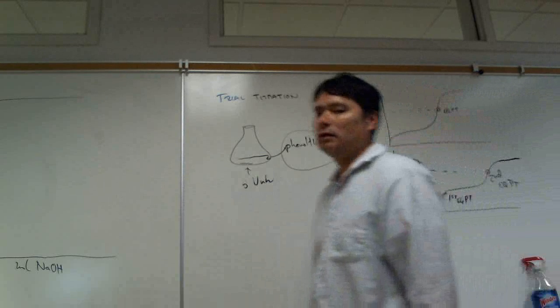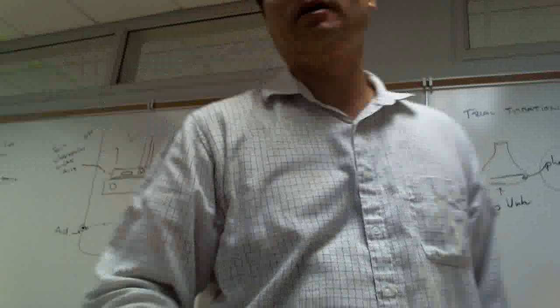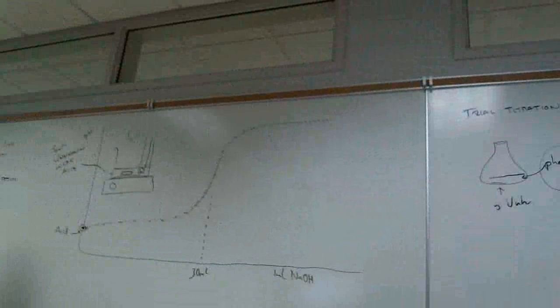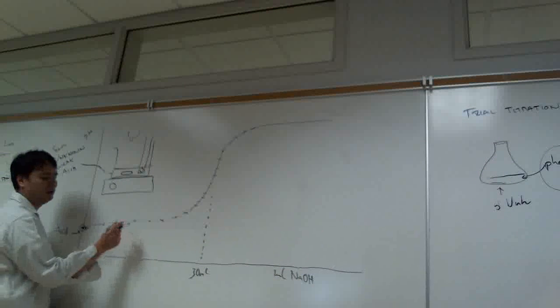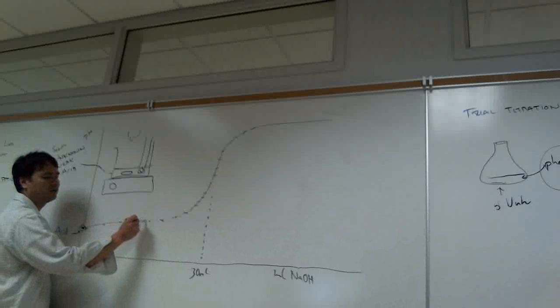So there are some critical points. For Tuesday, all we're doing is collecting the data. We aren't going to analyze anything. But when we're collecting data, we have to be careful to make sure we get good data. So for example, if this is a monoprotic, you want a lot of data around 15. Do you know why you want a lot of data around 15?